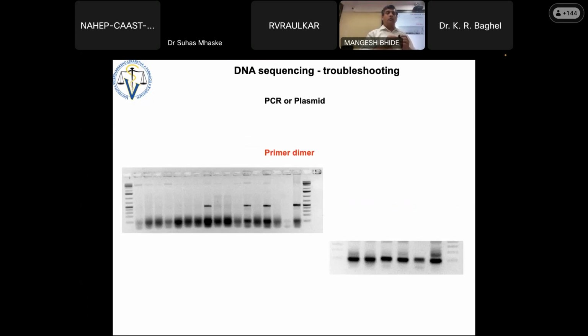Do you remember from my first presentation the self dimer, cross dimer or heterodimer? This is a typical picture of a dimer. Where are those dimers? Can anybody tell me? Here. Yes, these are the typical dimers, either self or heterodimers.